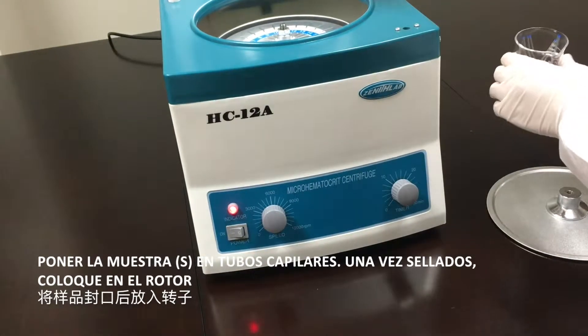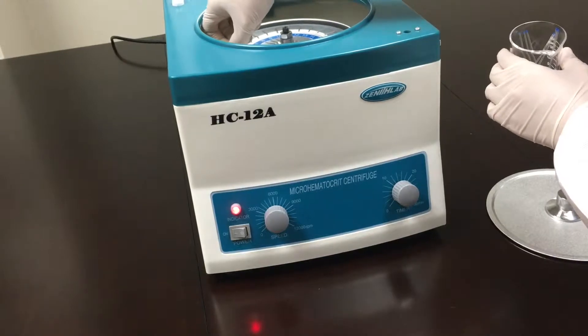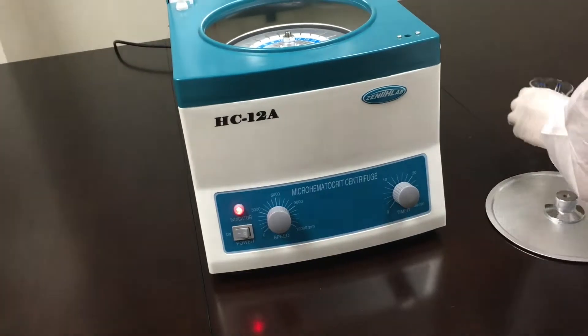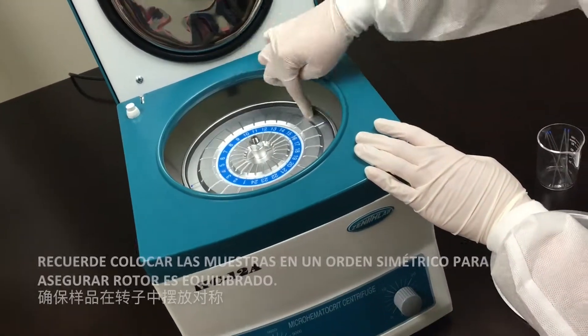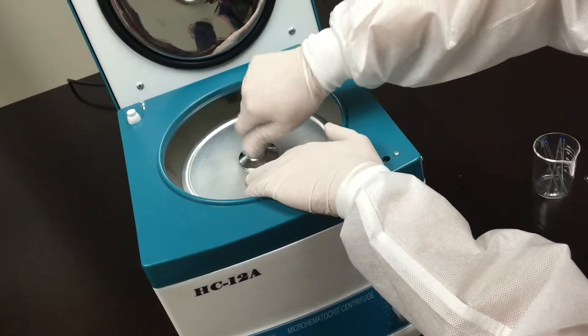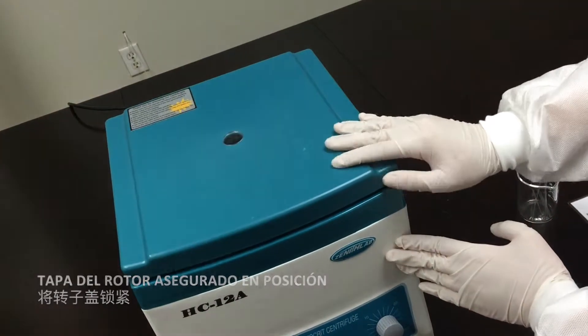Put samples into capillary tubes once sealed, then place into the rotor. Remember to place samples in a symmetrical order to ensure the rotor is balanced. Lock the rotor lid into place.